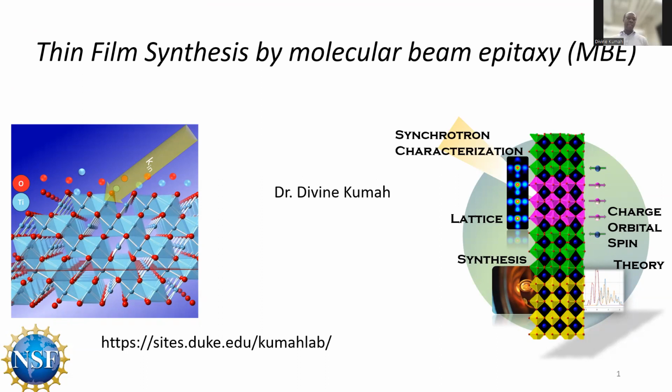In this technique, the way it works is that you have a molecular beam, which is formed by evaporating different elements of really high purities inside of an ultra-high vacuum system. And by controlling this process, we're able to make atomic layers which are formed when these different materials react on a crystal surface.